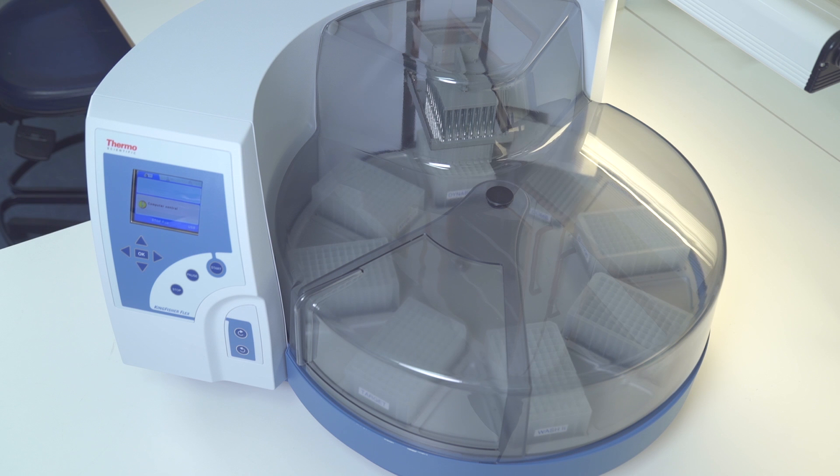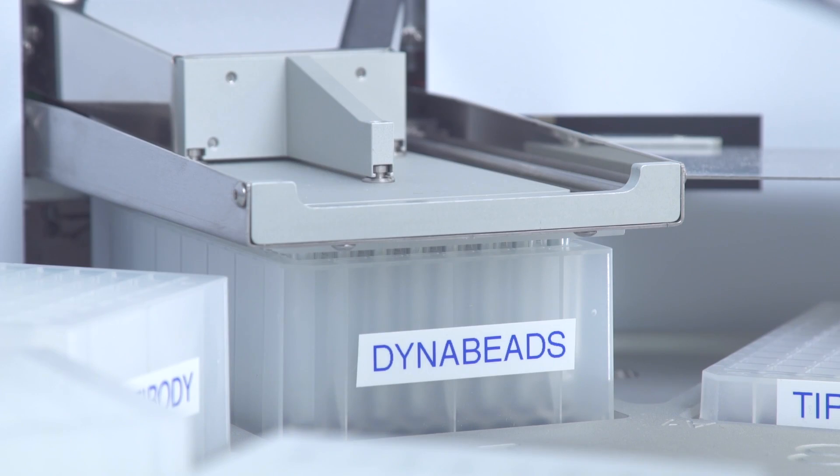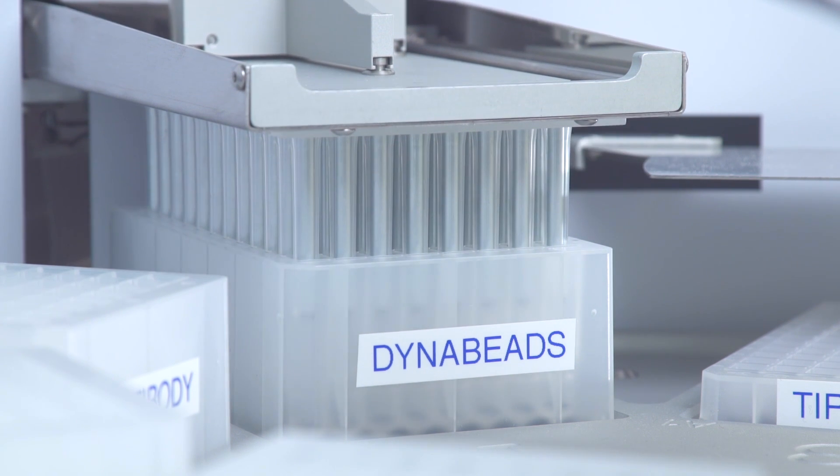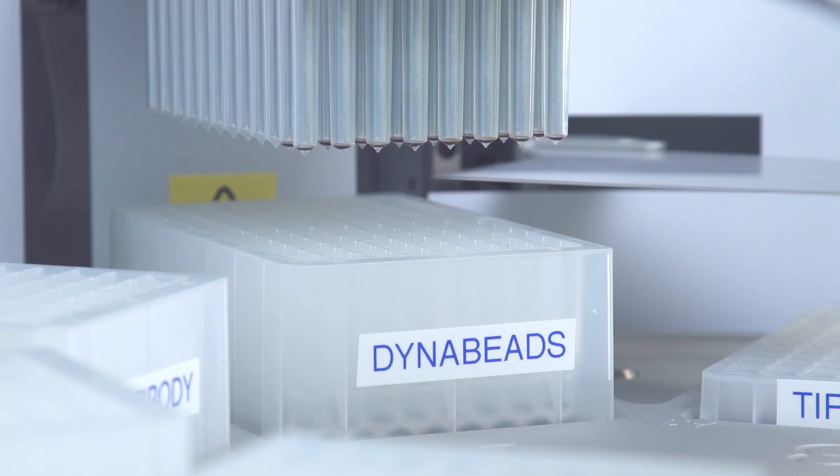In this video, we show the benefits of the KingFisher Flex instrument using Invitrogen DynaBeads magnetic beads, performing an automated reproducible immunoprecipitation in only 40 minutes.